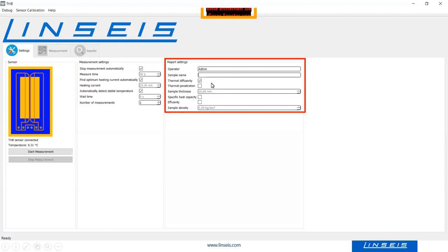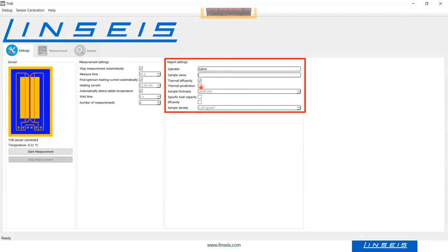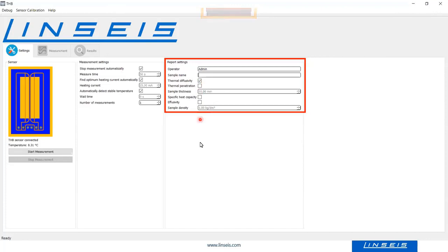You just type in the sample name. If thermal diffusivity should be measured or calculated, activate the corresponding hook. From the diffusivity, other properties can be calculated — such as thermal penetration depth and specific heat capacity. If you activate the heat capacity hook, you need to type in the density, because density is needed to calculate specific heat from diffusivity and conductivity. The effusivity can also be calculated from the thermal diffusivity.